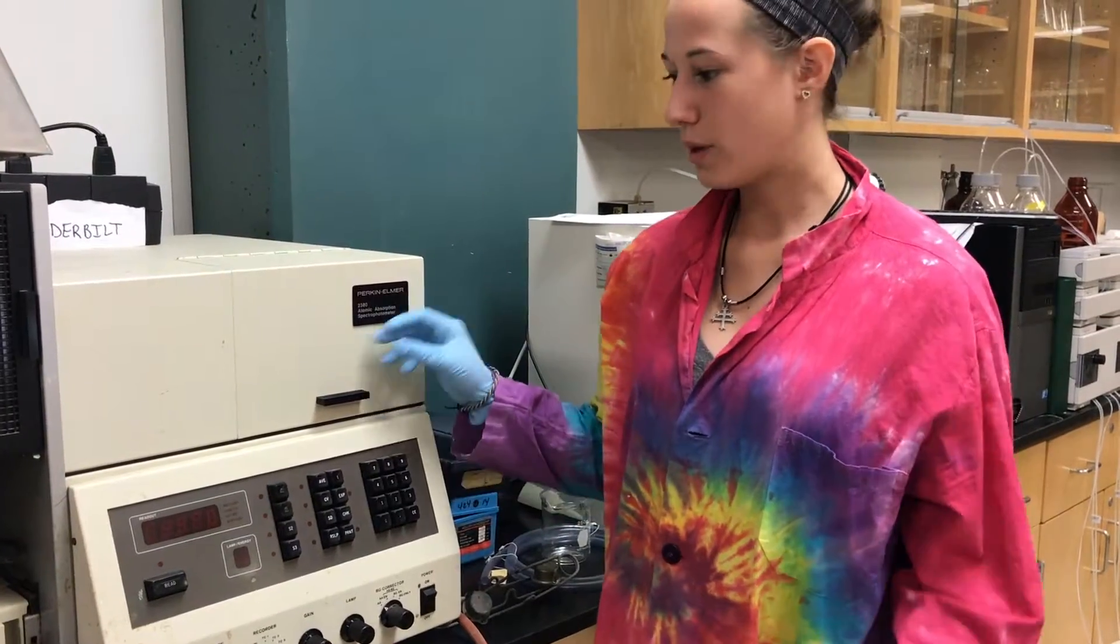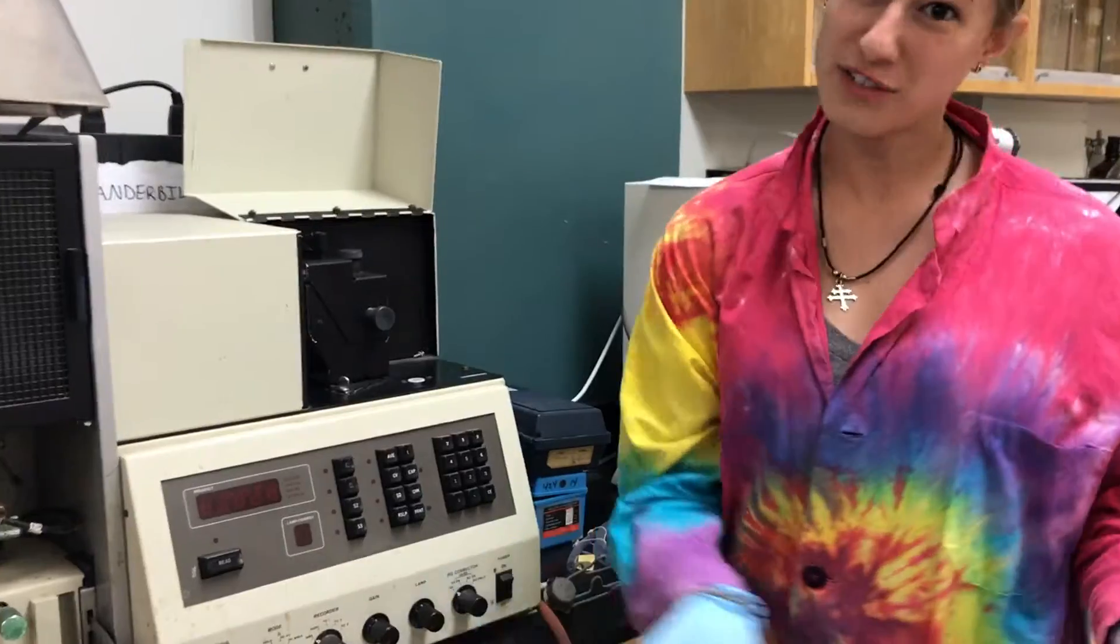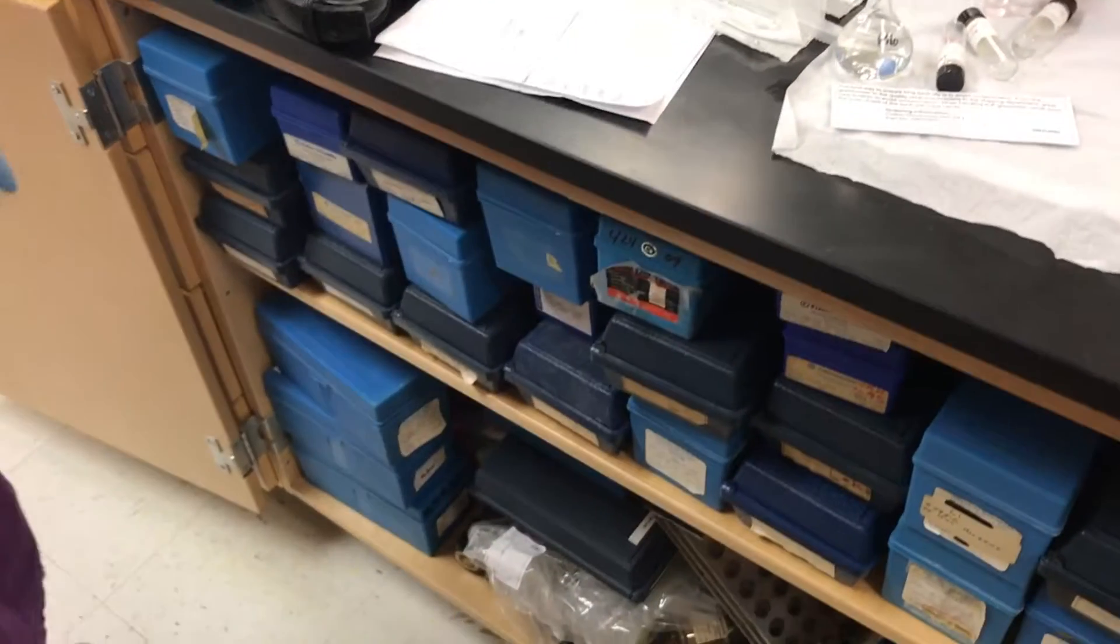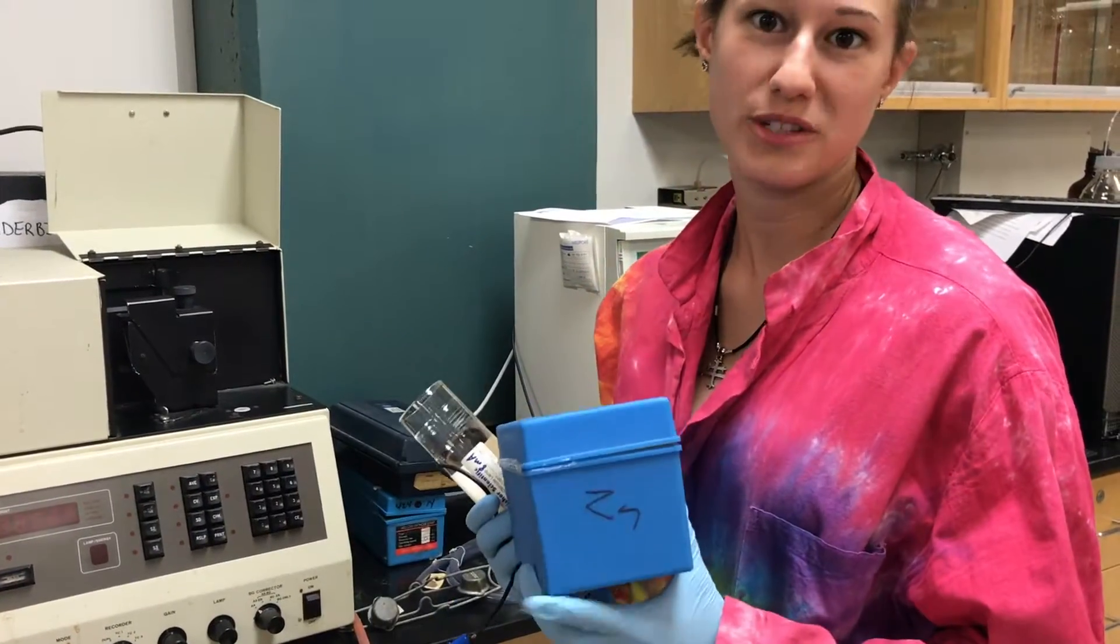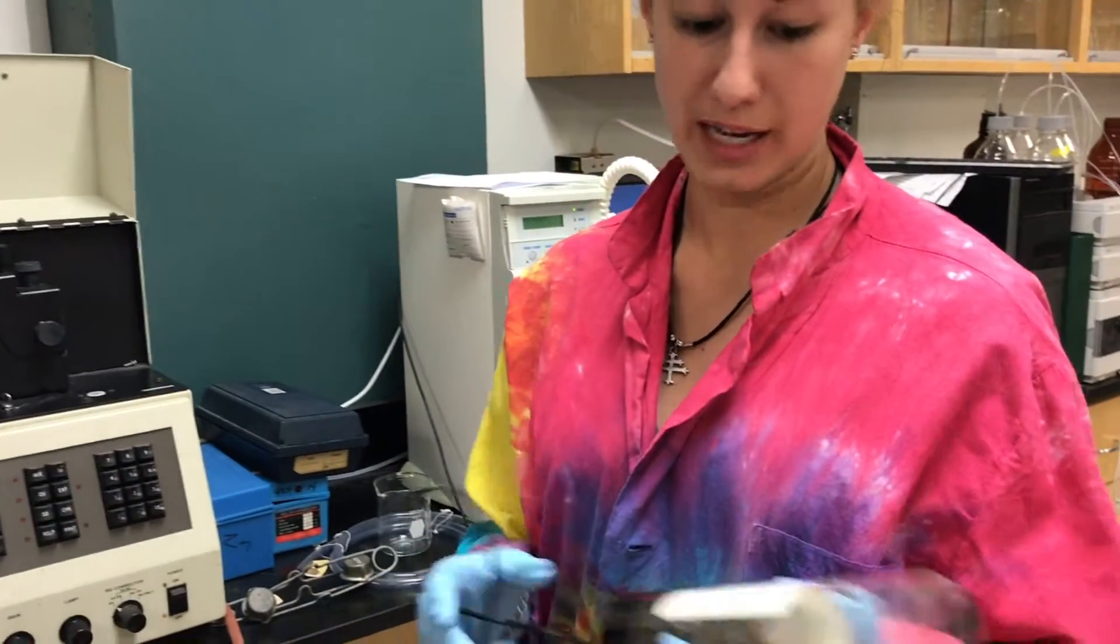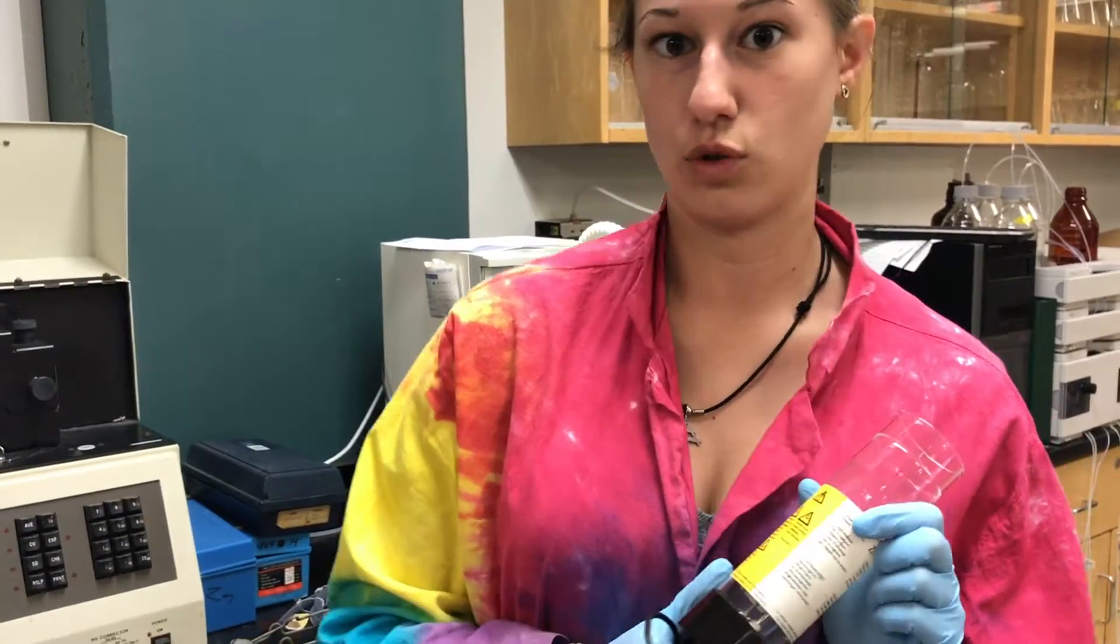Before we can get started, we have to insert a lamp into the instrument. Here's where you can find the lamps. You choose a lamp based on the element that you're trying to analyze. For our experiment, we're going to use a zinc lamp.